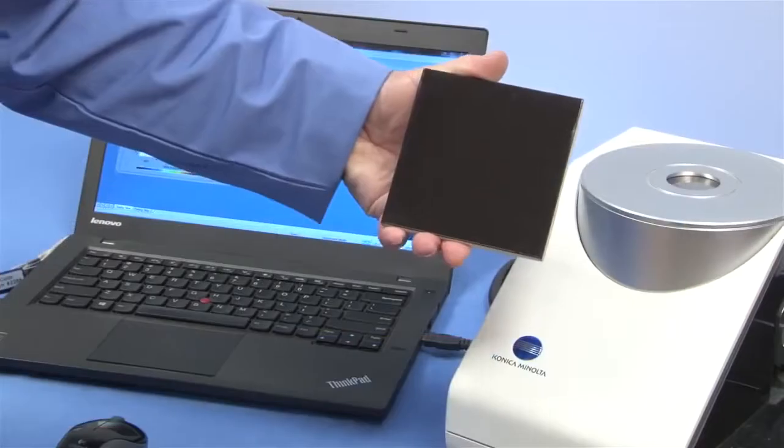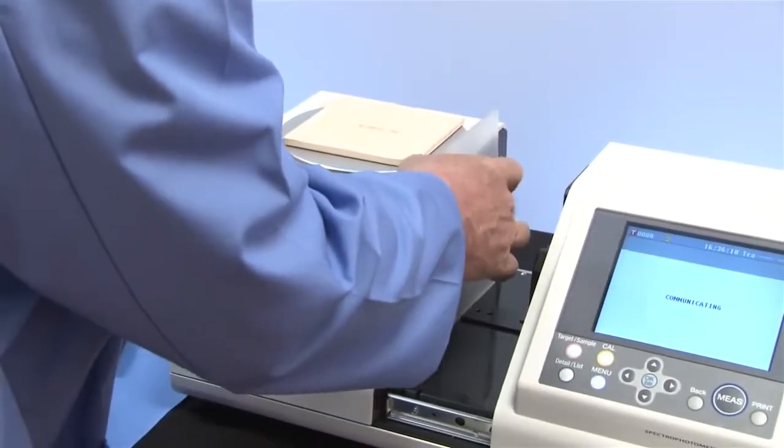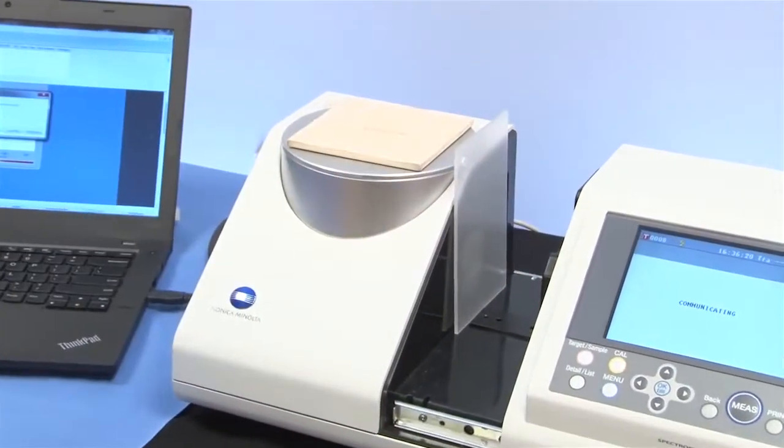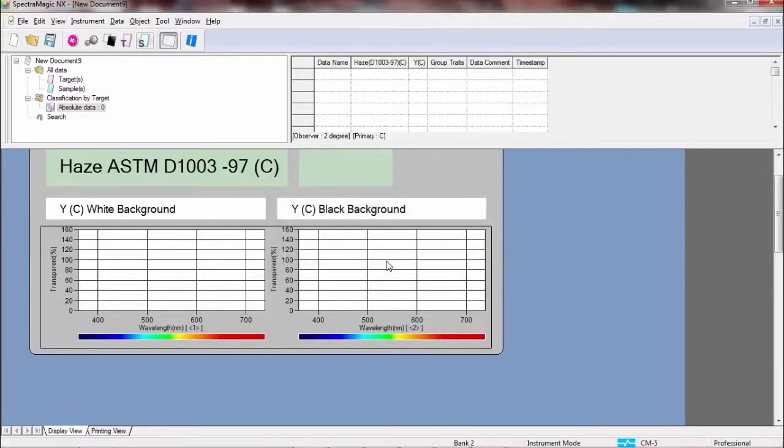The reflectance port must be blocked. SpectraMagic NX allows for measurements of haze with the use of a custom template, an important quality control procedure for many industries.